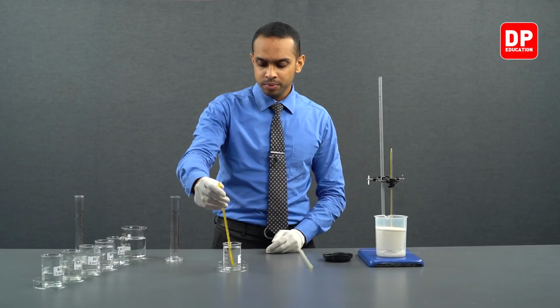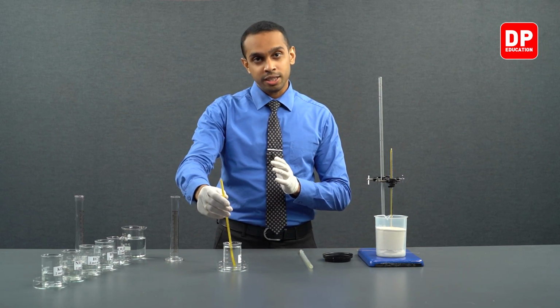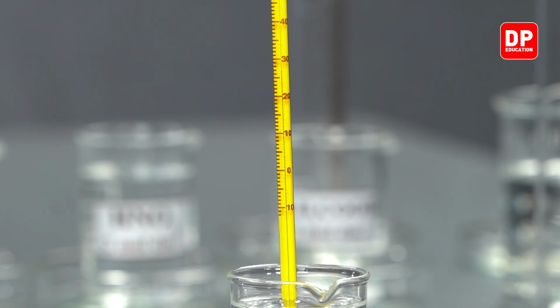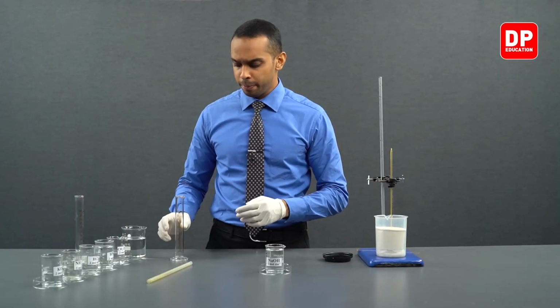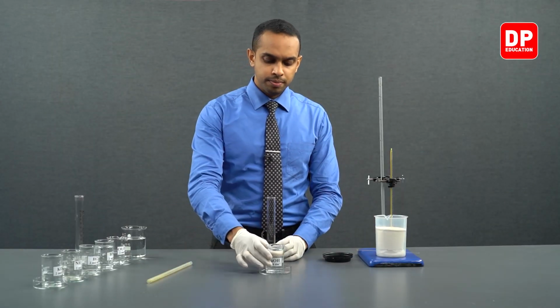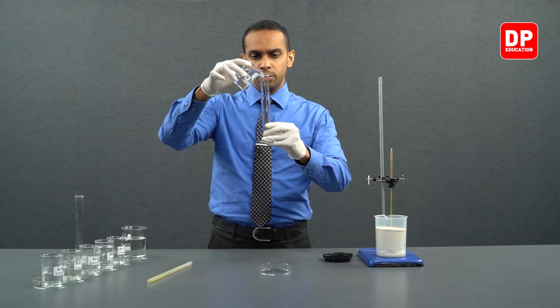The temperature of the sodium hydroxide solution is also at 27 degrees Celsius. Now, let's move on to the next step of our reaction. In our next step, we are going to measure 50 milliliters of sodium hydroxide solution.